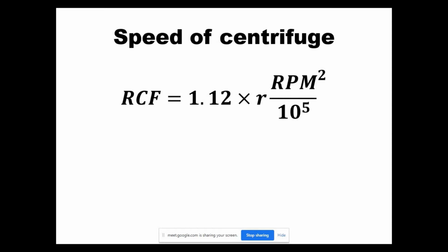When you're adjusting the RCF, for blood we use an RCF of 2000 times G. If it's the smaller machine, you put the RCF of 2000 times G, and on the bigger one you also put 2000 times G, no problem. Because on the bigger one, when you put 2000 times G, the machine will automatically adjust the RPM as per the RCF.